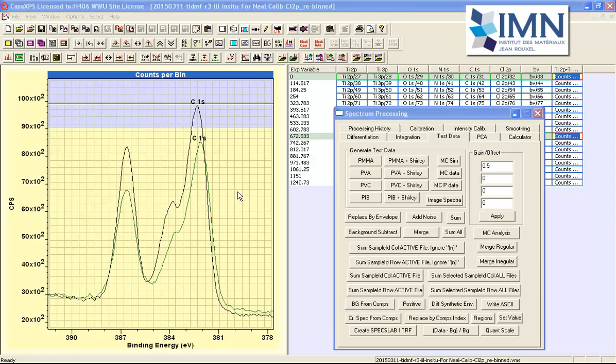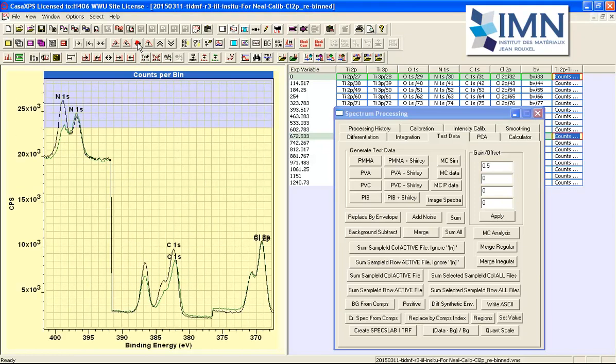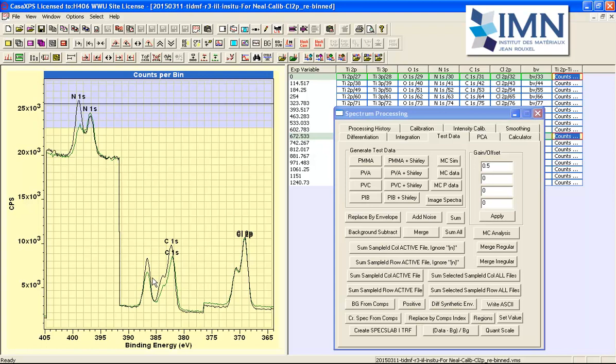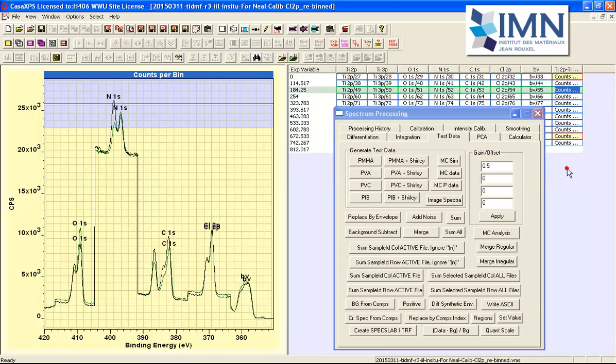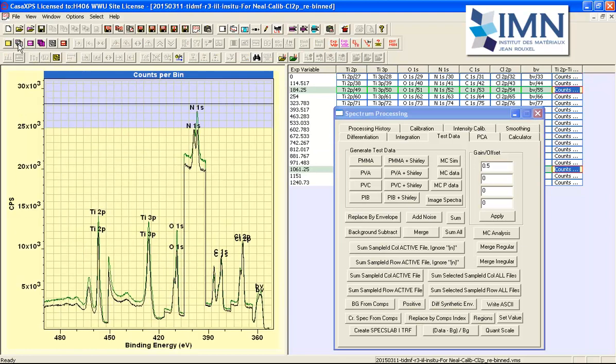Simply inspecting these carbon 1s spectra, you can see that things have changed. If you consider the relationship between how peaks have evolved in the one carbon 1s with respect to the nitrogen, for example. You might also consider how an oxygen peak is evolving with respect to the carbon 1s and the nitrogen. While it's useful to compare in this way, these merged data, the other advantage of merging these data and having them in this particular form is that we can construct different spectra.